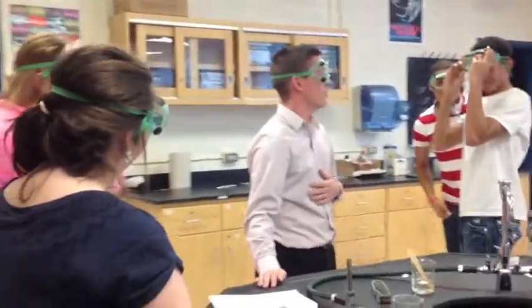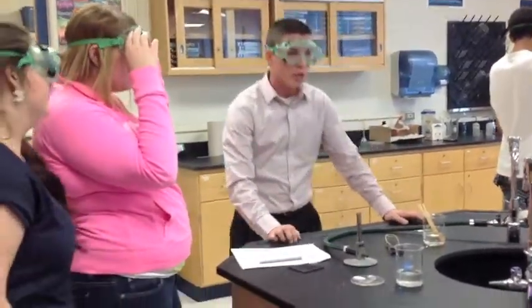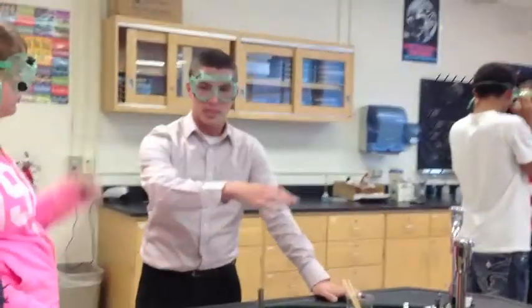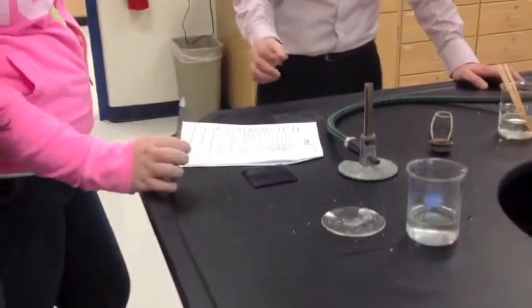All right, so you guys are free to go now. You can begin working. I'm going to continue working here. What you guys are doing now is basically going through and indicating the flame color. This is the data that we're getting.